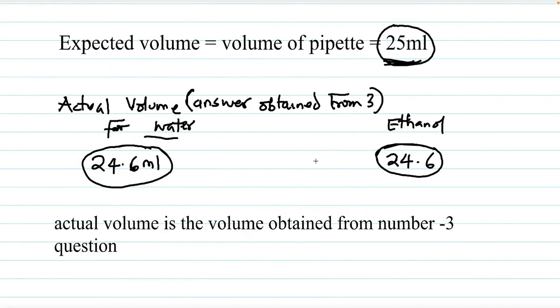Okay, so the last but not the least is the density of the mixture. Density of the mixture.